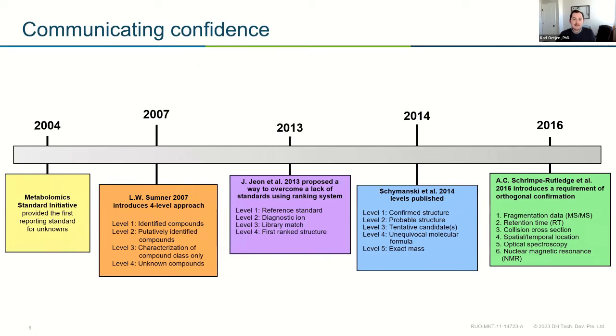The next thing that I just want to reintroduce, because I think this is honestly the most important thing for any high resolution mass spectrometry, and I'd argue mass spectrometry in general, is how do we communicate confidence? Confidence is really important when we're relaying these results to maybe a lab manager, maybe a director, maybe we're going to court. How do we communicate how confident we are in what we've observed?